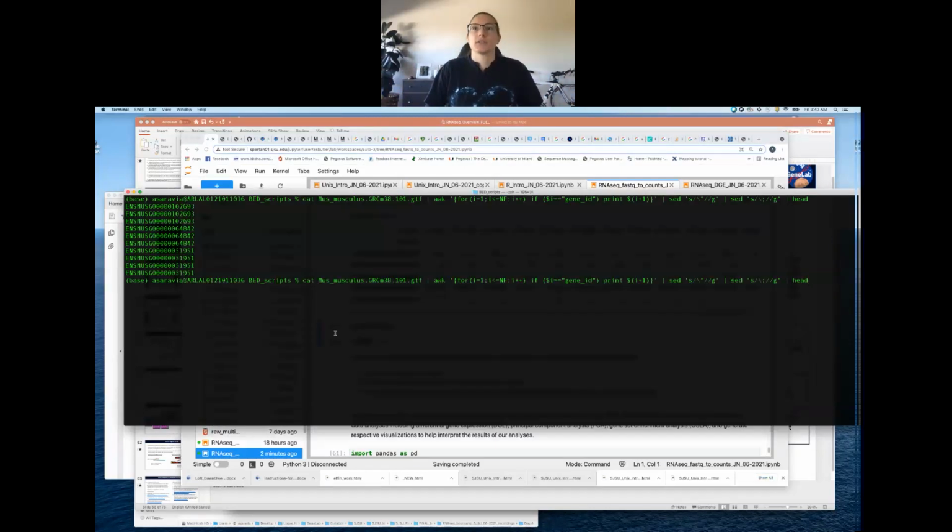In order to do that, you could use this other function called sort, another function of Unix, and then I can add a flag to sort called -u, and that says, go ahead and sort this, and then after you're done sorting it, only take out the unique lines. That's what I did here.